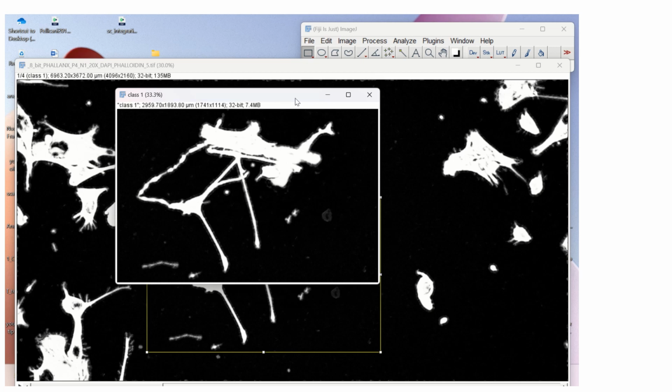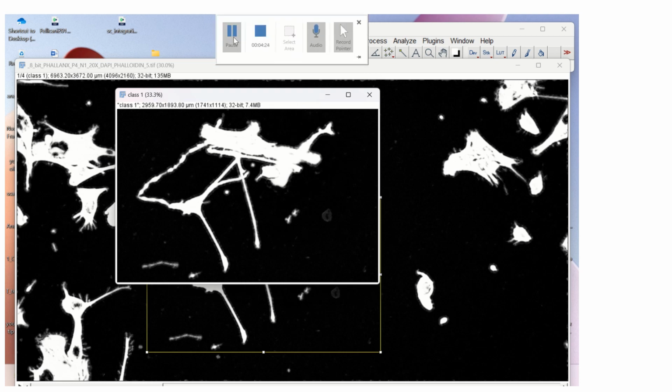If you want to automate, you would record and then set the numbers that we played with. But the only problem for our data is that we can't, because the circle that we want is not always in the same location. So we're going to do it manually. Then you just go to File, Save As, and then you're done with the region of interest portion.